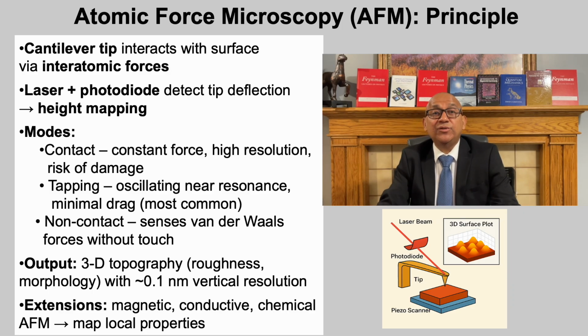AFM operates in several modes, each optimized for different materials. In contact mode, the tip maintains a constant repulsive force with the surface. Excellent for hard, flat samples, but potentially damaging for soft films. In tapping mode, the cantilever oscillates near resonance, touching the surface intermittently.